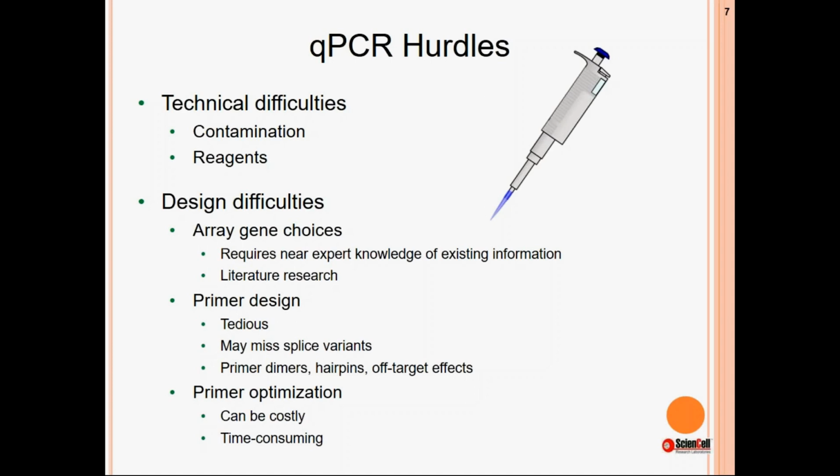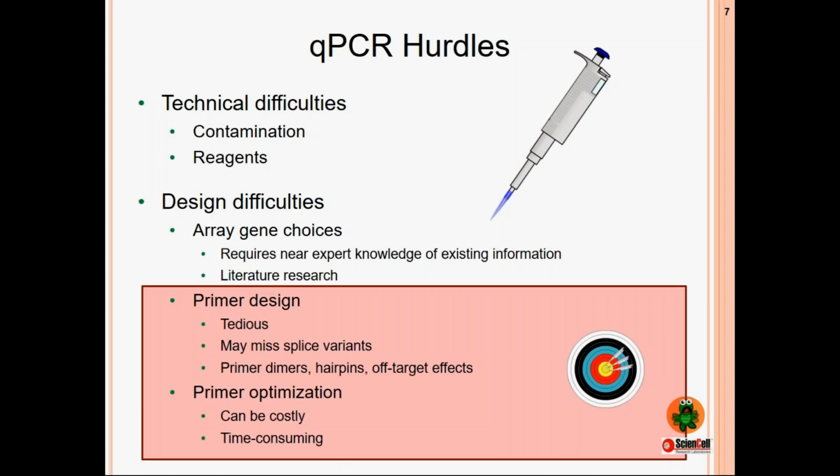Now, arguably, the most important part to designing an optimized qPCR experiment is designing and using good optimized primers, since qPCR sensitivity is only as good as its primer's efficiency. Aside from just being a little tedious, this aspect of qPCR design is also where unwanted and uncontrolled variability is most likely to be introduced.